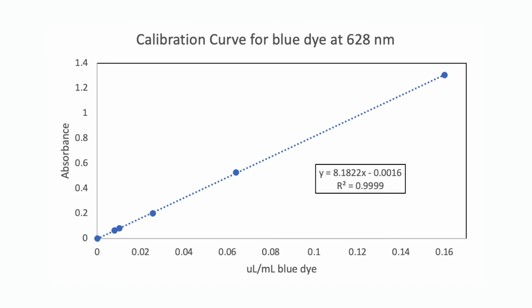This is where the Beer's law concept comes in, because this line should correspond to A equals ABC. Although we have an intercept, the value is so small and this arises from uncertainty in our analysis, so we should still keep it in.